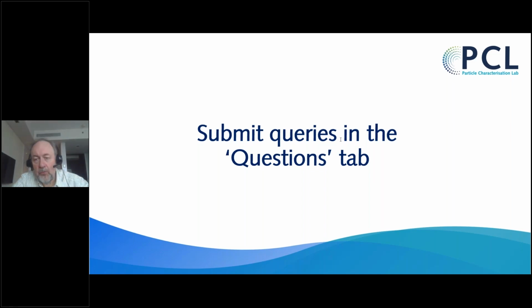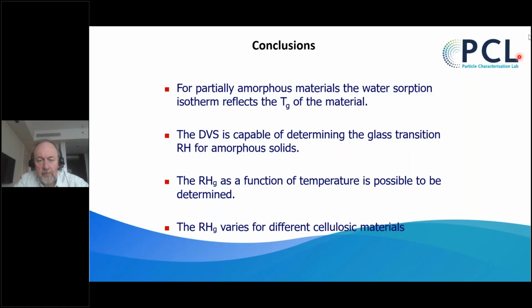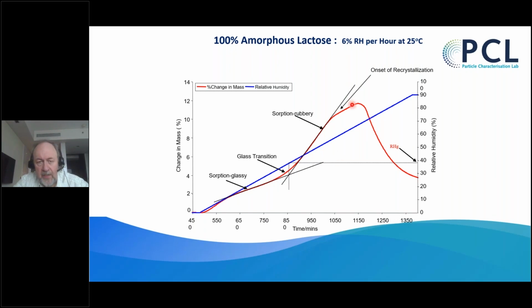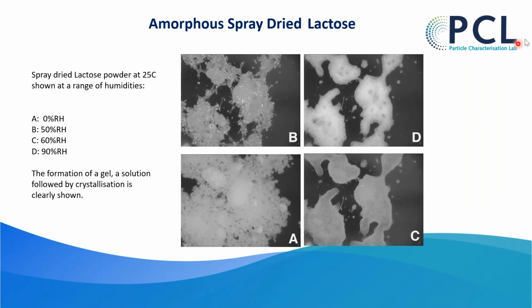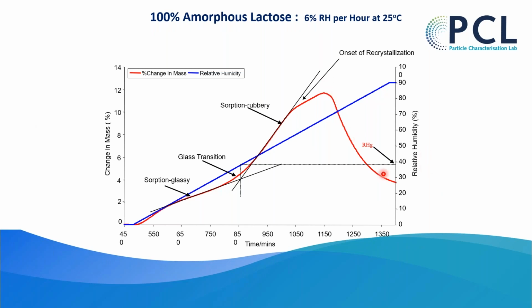What's happening towards the end, and maybe if I get the slide up it might be helpful. You're asking about this part of the curve here, which is interesting. What's happening here is the lactose is forming a monohydrate. The lactose monohydrate forming here is ejecting the water out of the sample. So this is loss of water due to monohydrate formation. Basically, crystallization is occurring. When the crystals form, there are no longer amorphous structures, and the water that was absorbed is now being ejected, and the only water left is the water of hydration. That's a good question. Thank you.